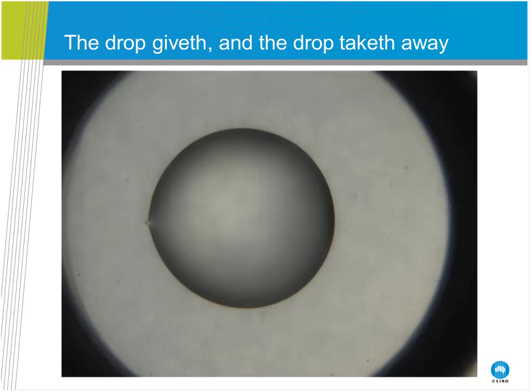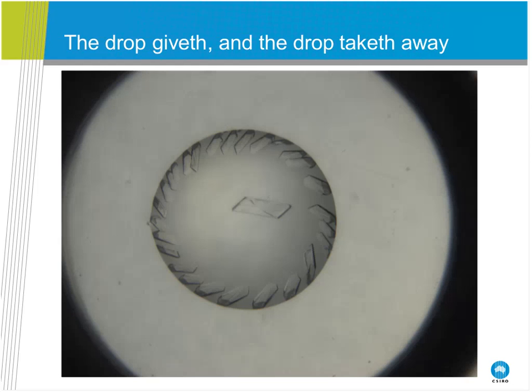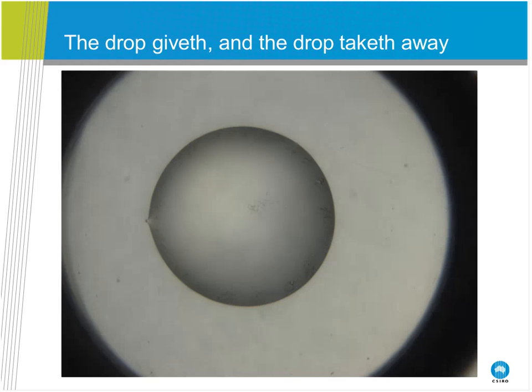So that was day 1. This is day 1. Then this is day 3. We have these stunning crystals in this sort of a Stonehenge arrangement. Day 5, they've disappeared, and you can still see the shadow of them. But without that imager, we would never have necessarily seen those crystals.